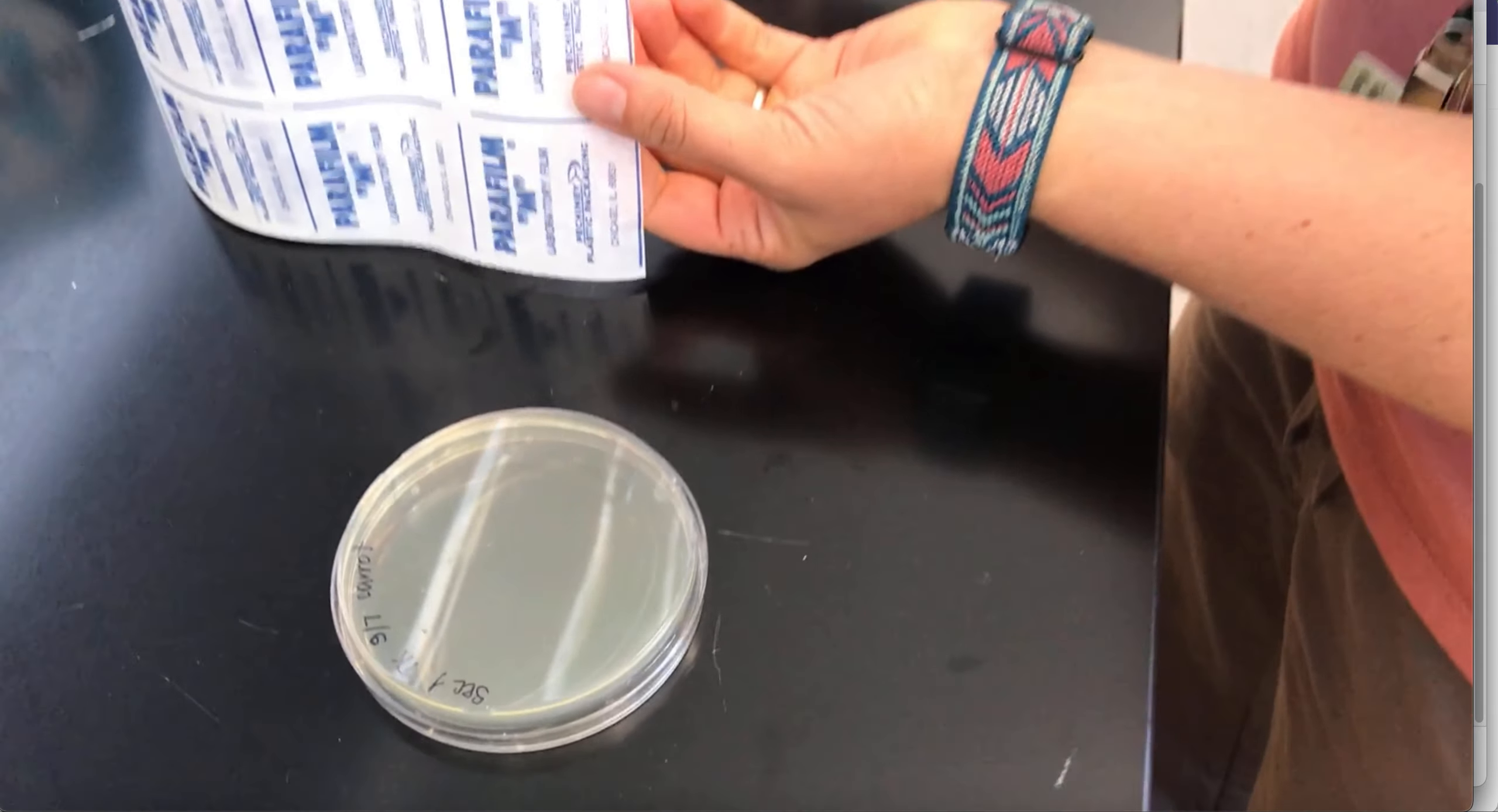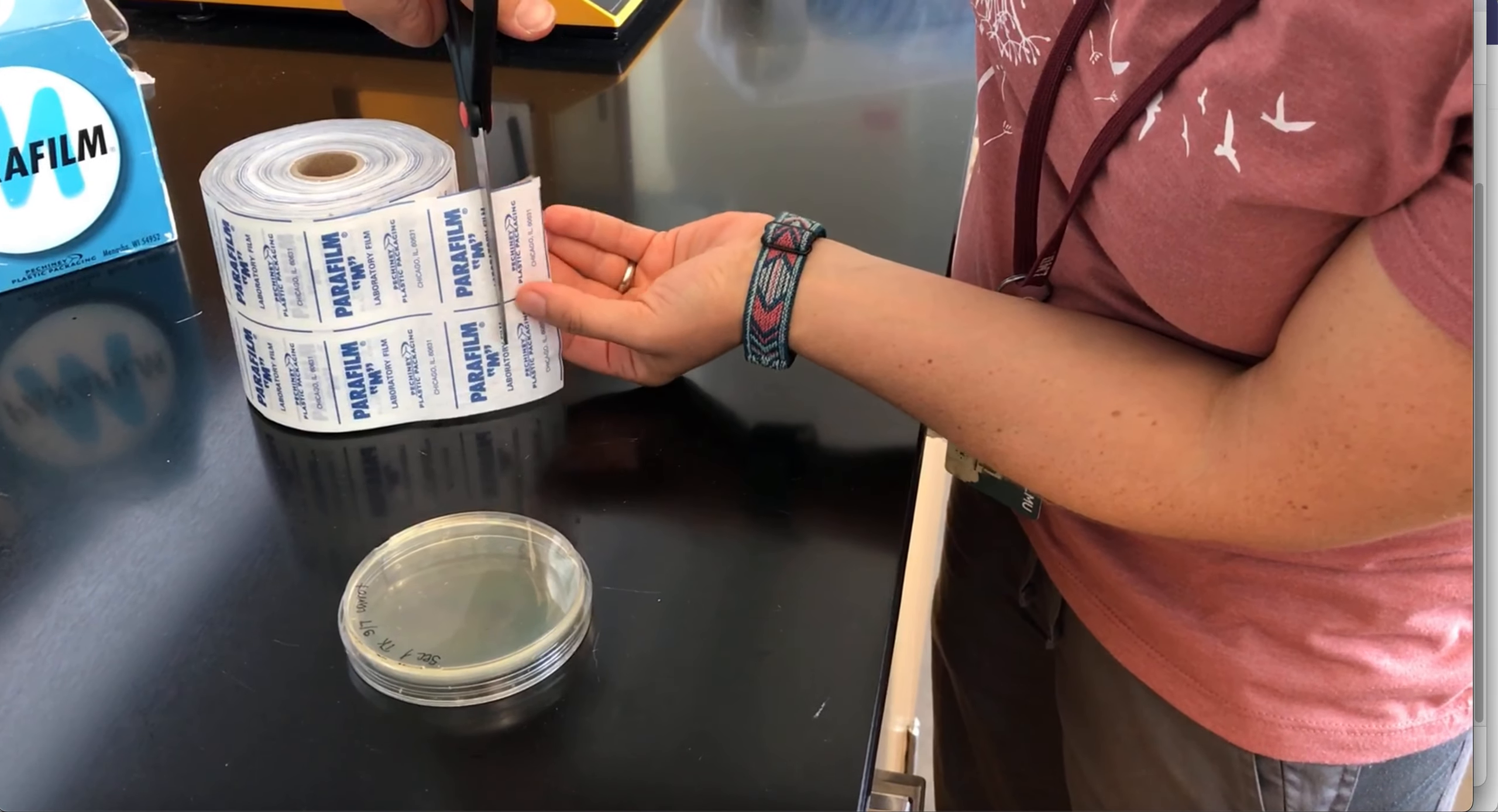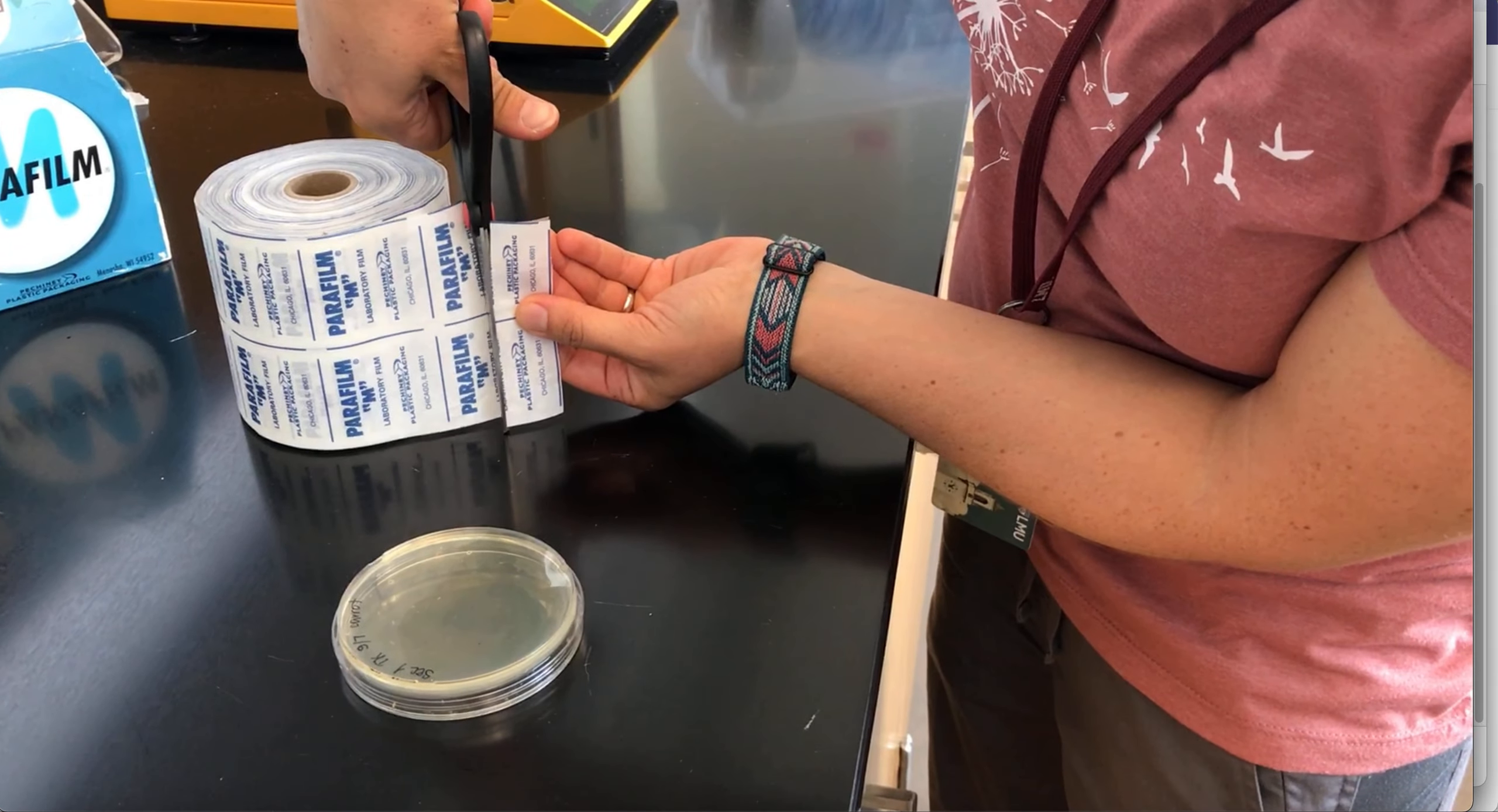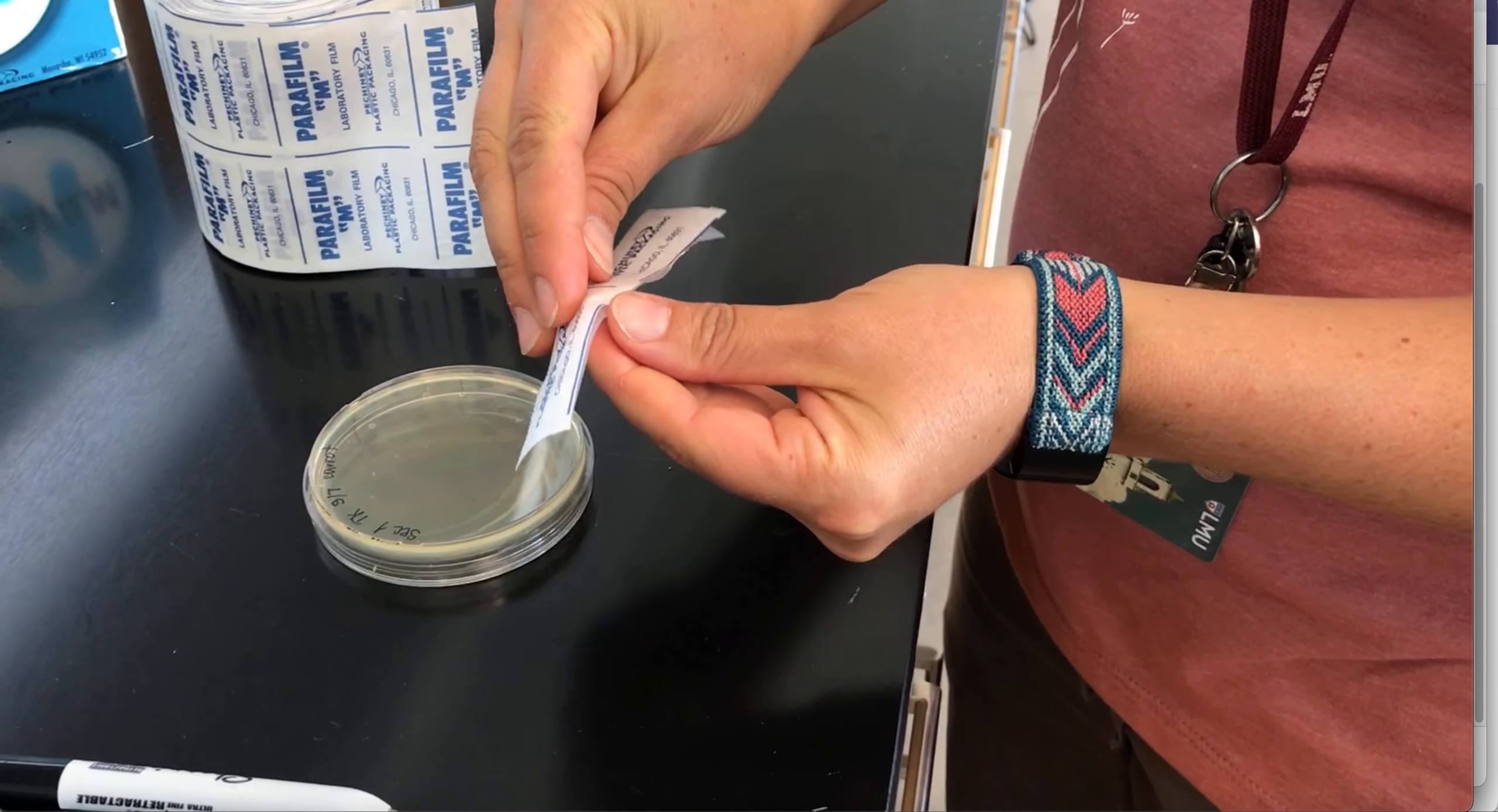Now I'm going to demonstrate how to parafilm the plate. Cut a half square width, double side piece of parafilm.